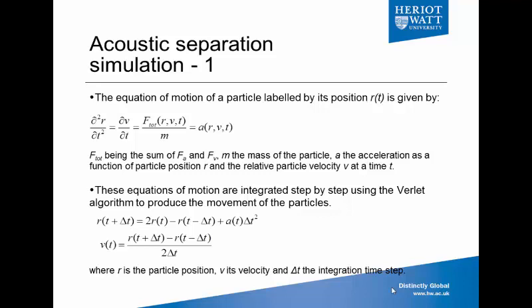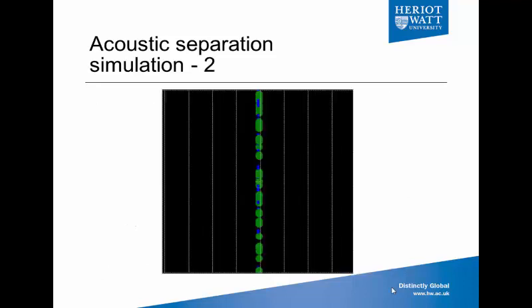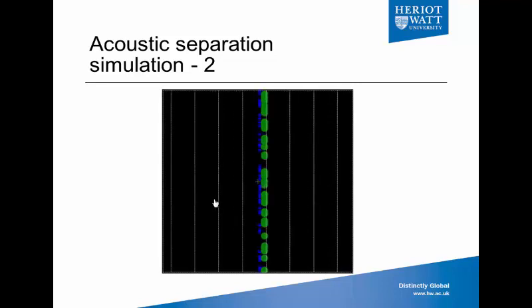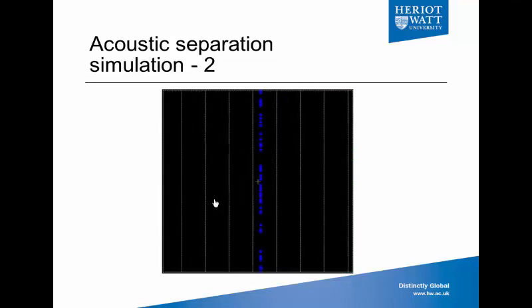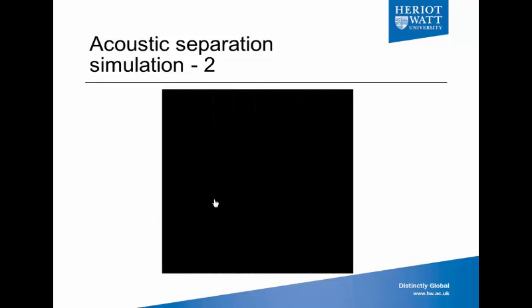This simulation program is based on the Verlet algorithm, which allows us to put different sizes of particles and also streaming, non-streaming, changing the viscosity of the medium, etc. When we enter our parameters and put our dynamic acoustic field, what we see is that the large particles shift from node to node while the small particles stay at their initial position.